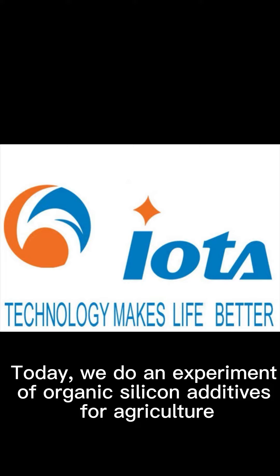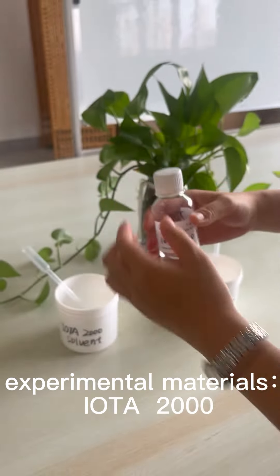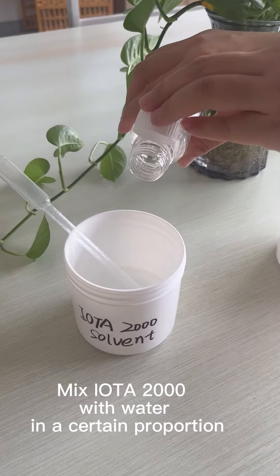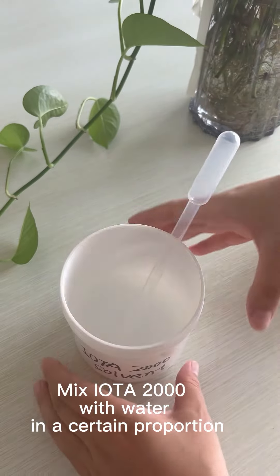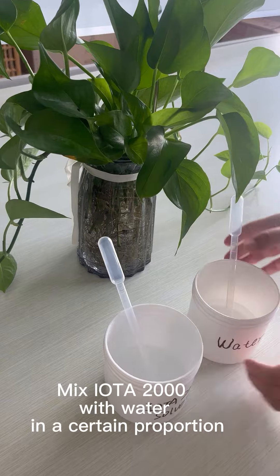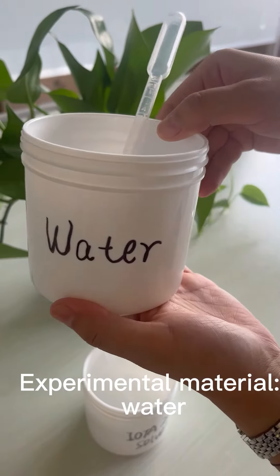Today, we do an experiment of organic silicon additives for agriculture. Experimental materials: IOTA 2000 — mix IOTA 2000 with water in a certain proportion. Experimental material: water.